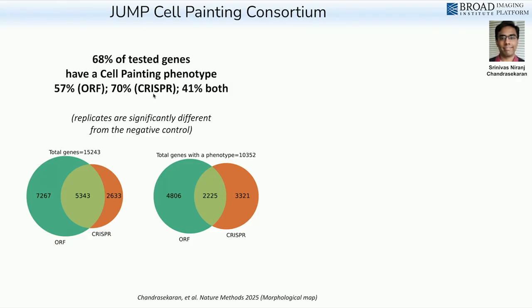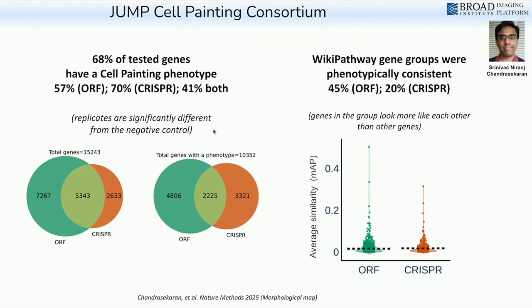The limitation here, in theory, we could have done the whole genome with arrayed CRISPR. However, we used the druggable library from Horizon, and that, of course, is selected to be genes that are likely to be more involved in biological processes and pathways. So probably these are roughly equivalent, like you're likely to get the same proportion if we had tested a bunch of unknown genes alongside these as well. So that's how that looks, and that just tells you how many genes are doing something.